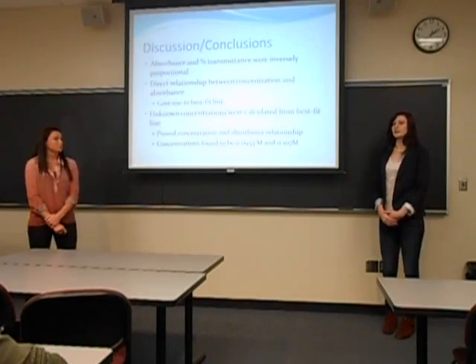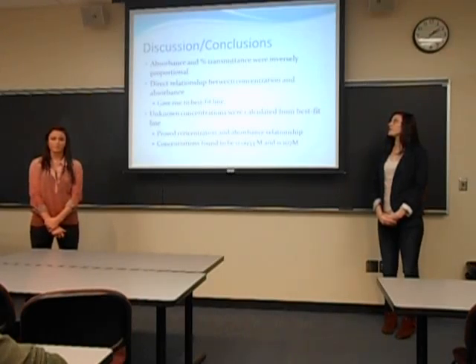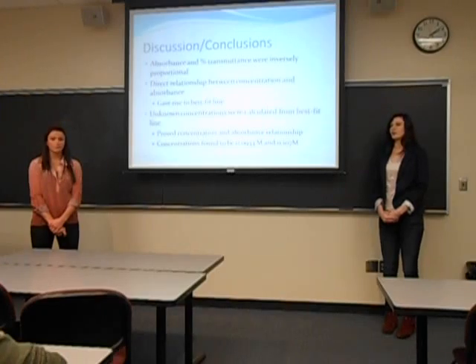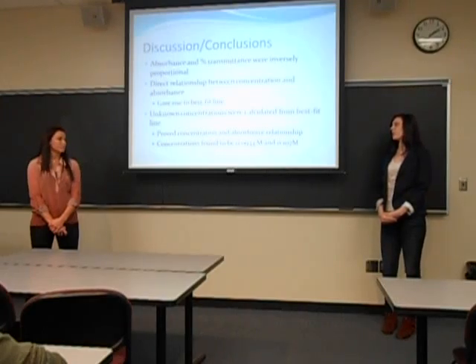Our final conclusions for number 4, a total wrap-up of our experiment. We determined absorbance and percent transmittance were inversely proportional, so as absorbance increased, percent transmittance decreased. We determined that there's a direct relationship between concentration and absorbance, meaning as absorbance increases, concentration increases, and this gave rise to our best fit line on the graph. Using the best fit line, we determined our 2 unknown concentrations, which were 0.0933 for number 43 and number 44 was 0.107 moles per liter.